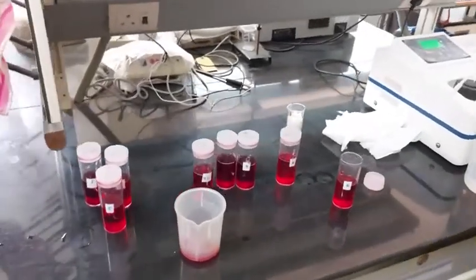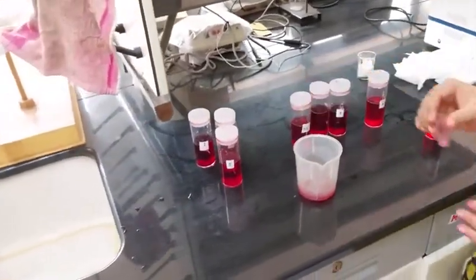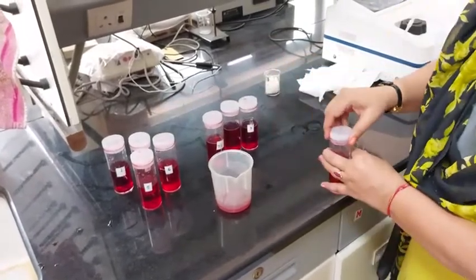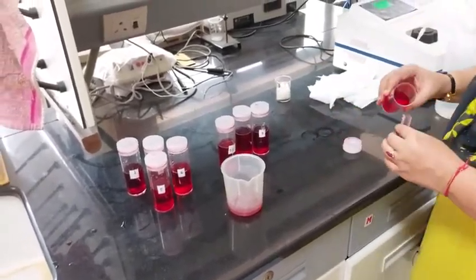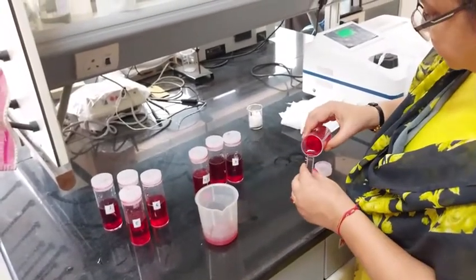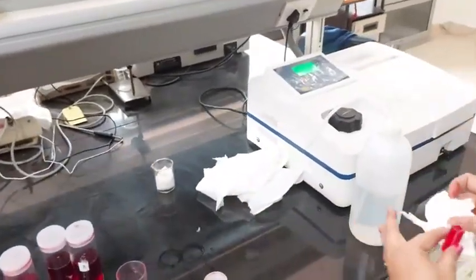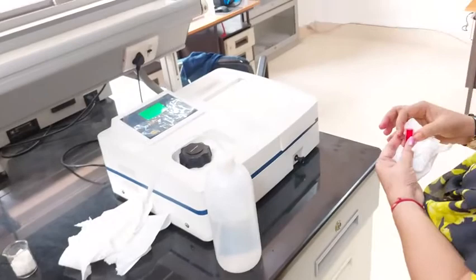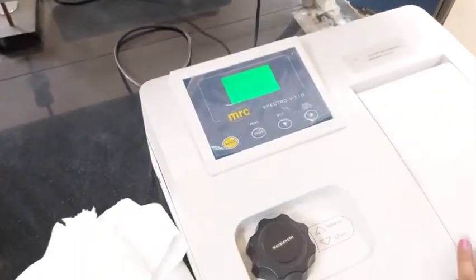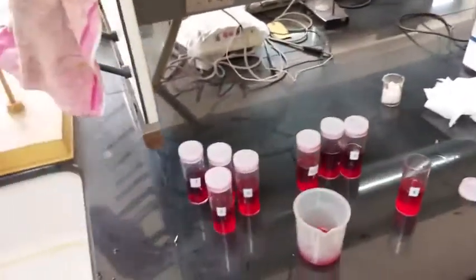And for the last standard, which is 1.4 milligram per liter, I am going to measure absorbance now. It's coming out to be 0.860.